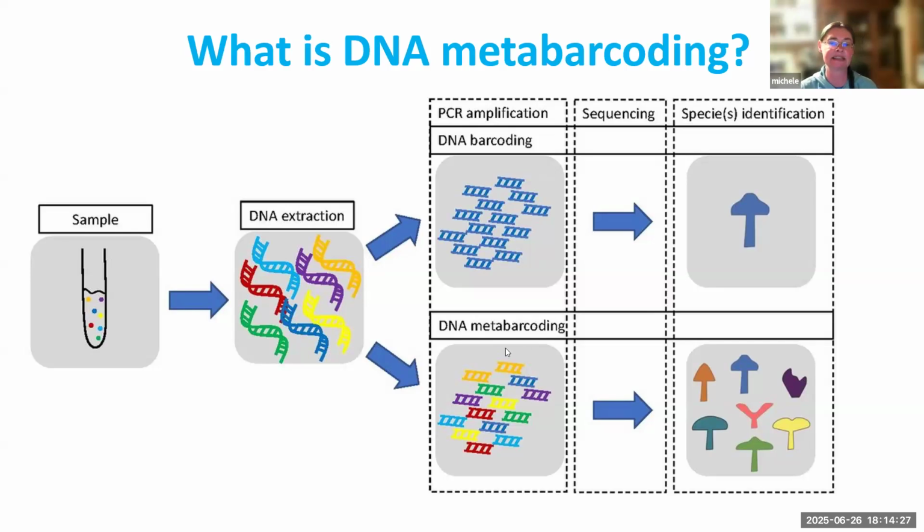Metabarcoding, on the other hand, takes DNA from an environmental source. So you'll often see this called eDNA. I'm old school, so I just refer to it as genomic DNA. eDNA would be the more proper terminology because when you're looking at an environmental sample, there's no expectation that it's going to be a pure culture, right? Of course not. It's a real world sample. And this can be river water, soil. And in our case, we're going to be talking about honey, specifically the pollen that's in honey. And in the end, you can actually take all the organisms and identify them simultaneously. And here's my analogy, and hopefully this makes sense to everyone.